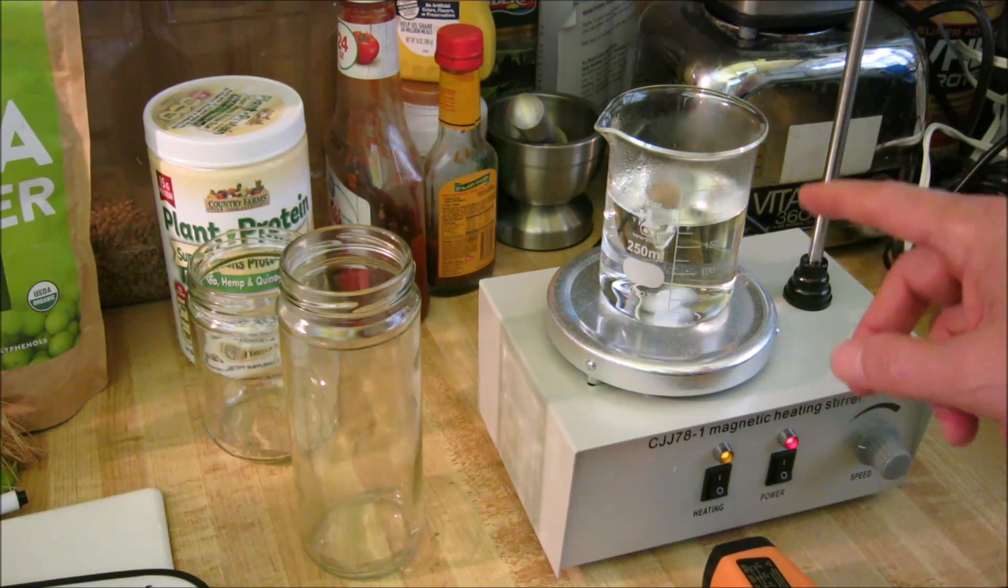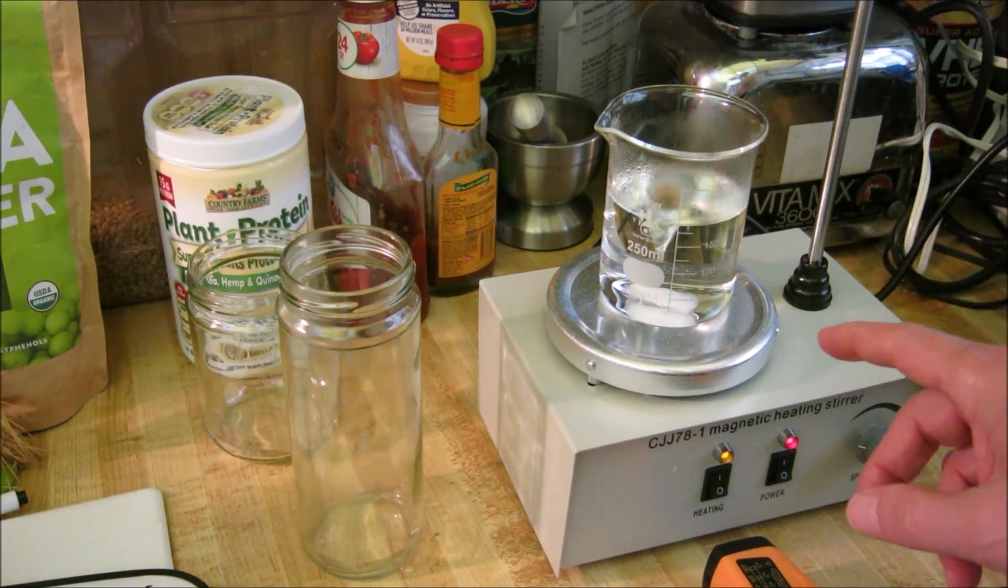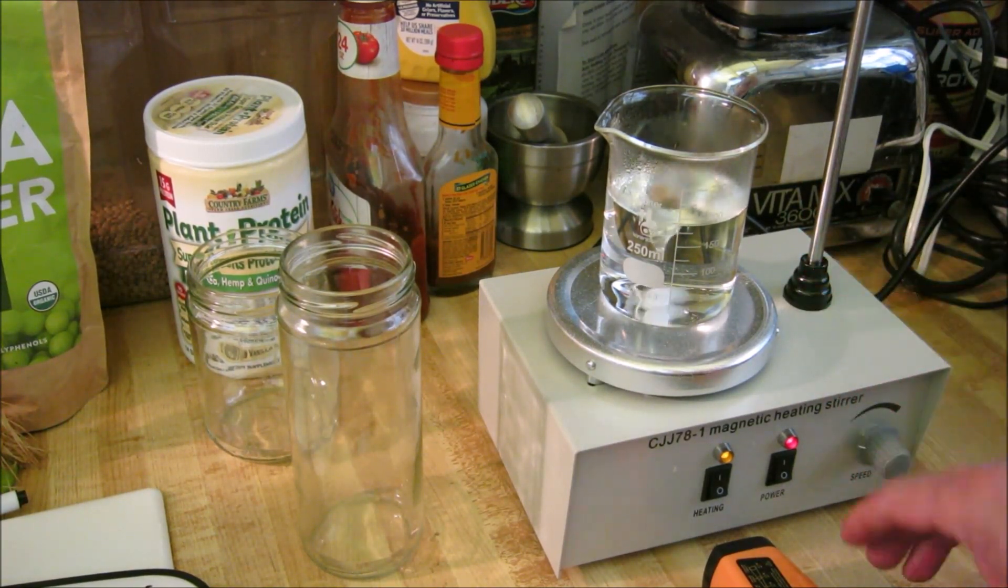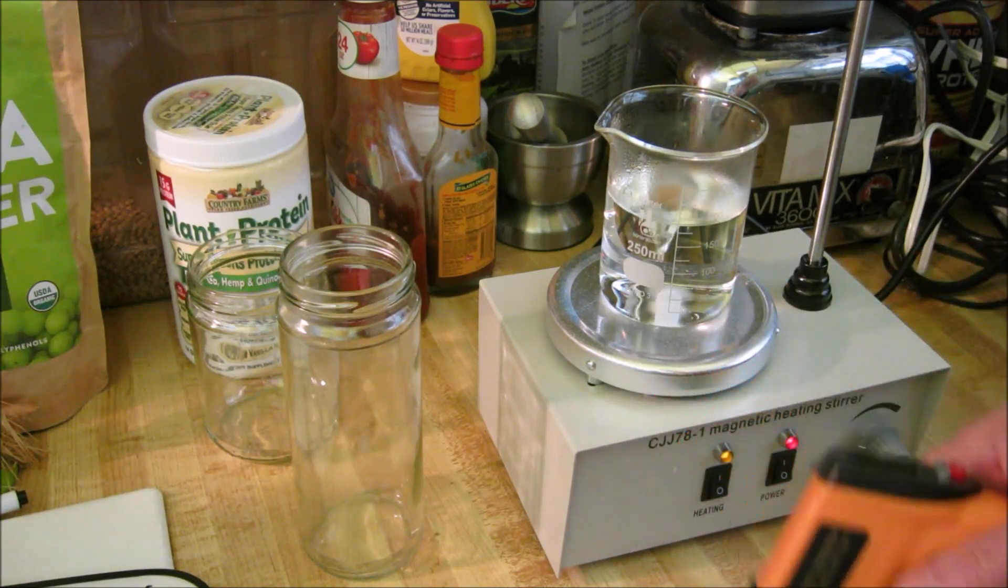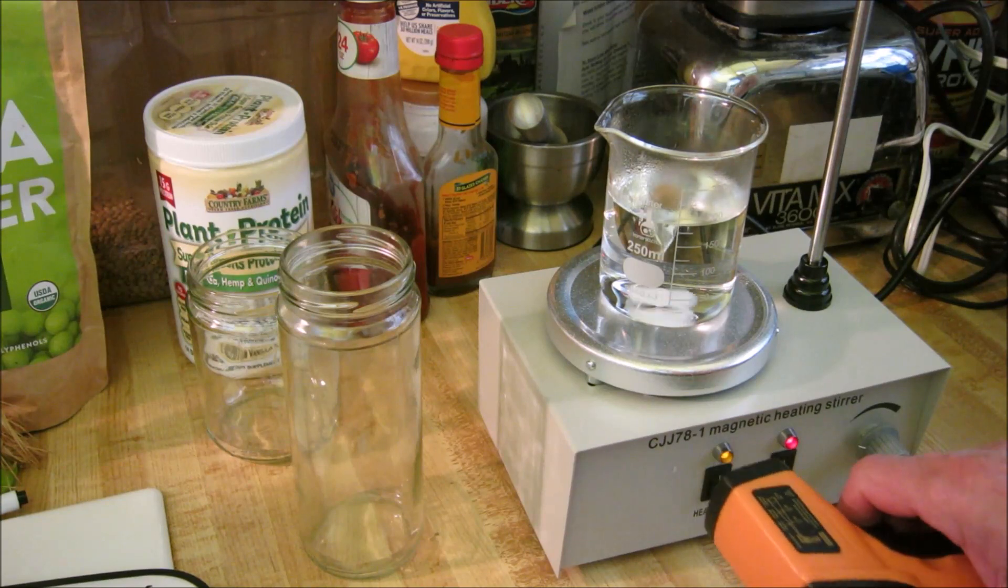It'll spin about 2400 RPM maximum. The maximum temperature I was able to get was about 330 degrees on the hot plate, or that's about 166 degrees centigrade.